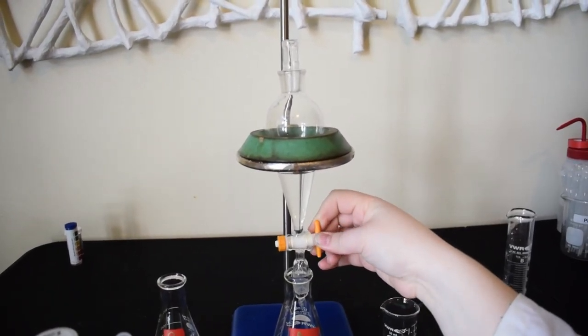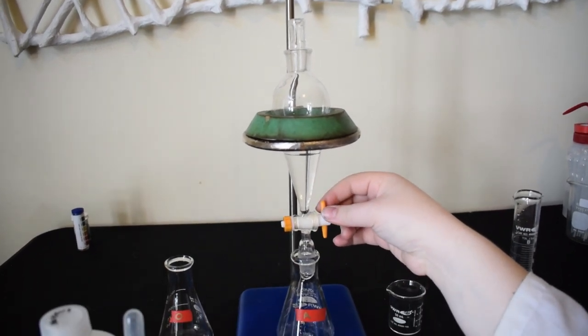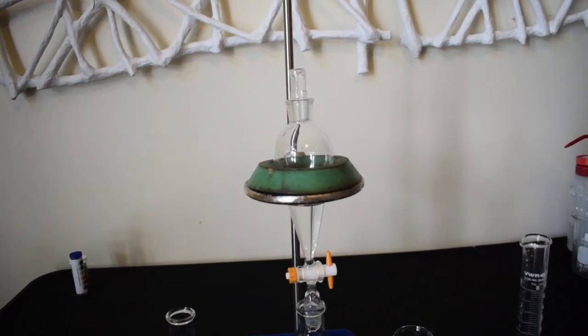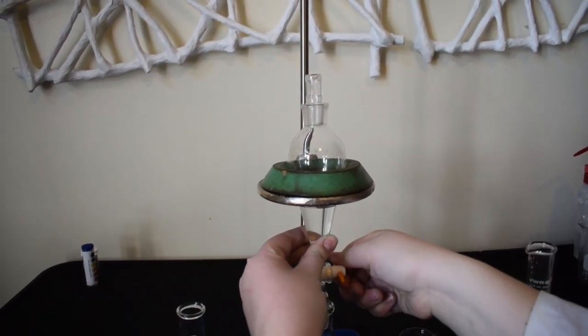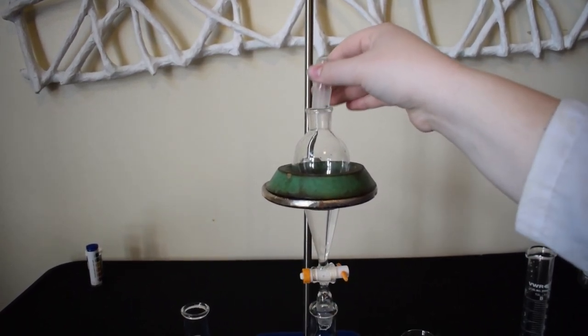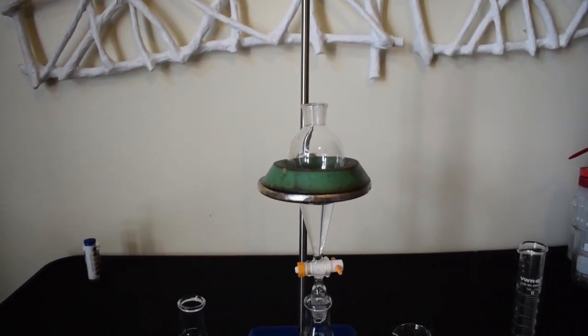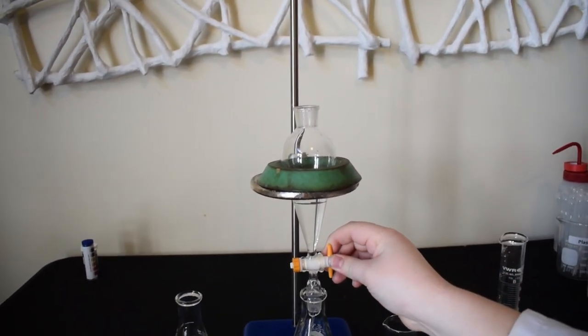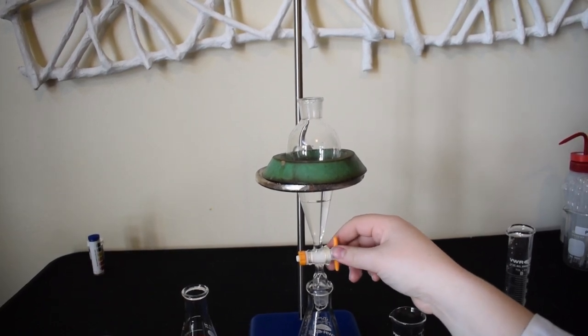Now it's time to drain. But it's not draining. Well, that's because we left the stopper on. One of the most common mistakes in working with separatory funnels is not removing the stopper before you try to drain off the bottom layer. Always make sure to remove the stopper and then open the stopcock to drain the aqueous layer.